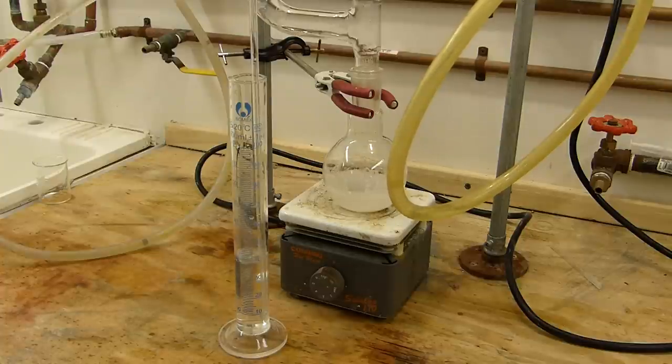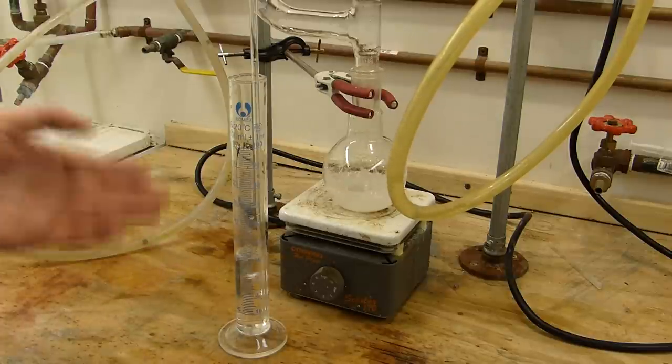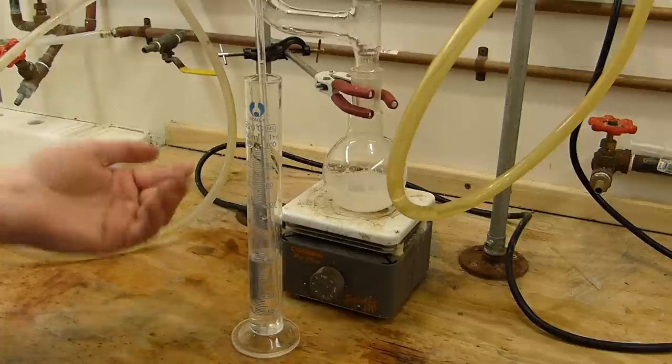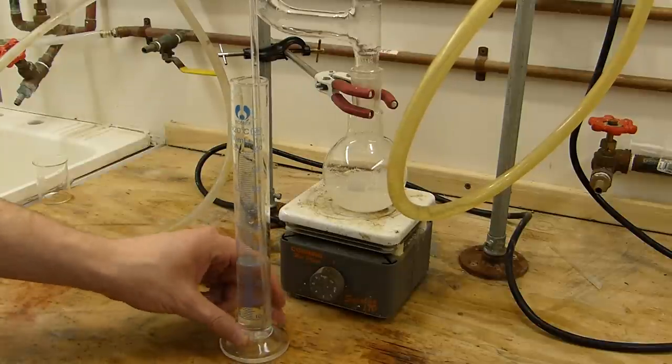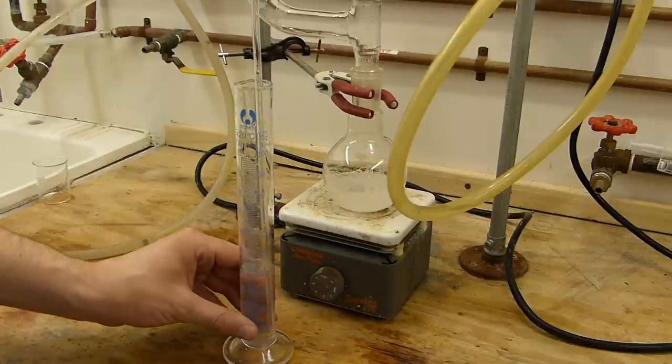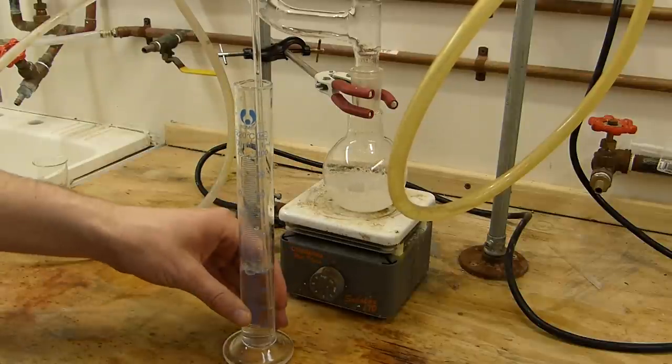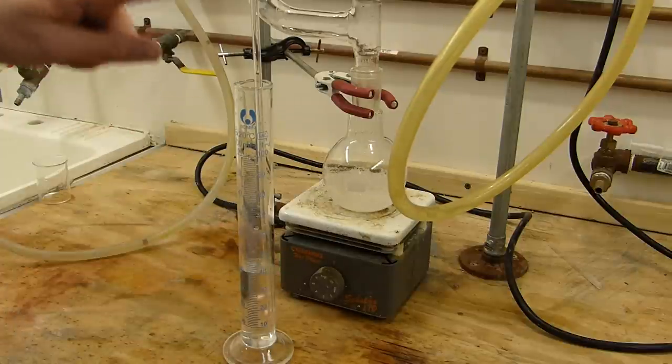I'll also discuss a little bit about suckback. Ammonia tends to be very susceptible to suckback because it's very soluble in the liquids that you tend to bubble it into, especially if you're bubbling it into an acid like hydrochloric acid or something with a low vapor pressure like sulfuric acid. That's because the vapor pressure of the solution that it's going into is very low, and so that tends to generate the sucking action when the ammonia starts dissolving in it. You'll notice that the liquid will start eating the ammonia up into the tube.